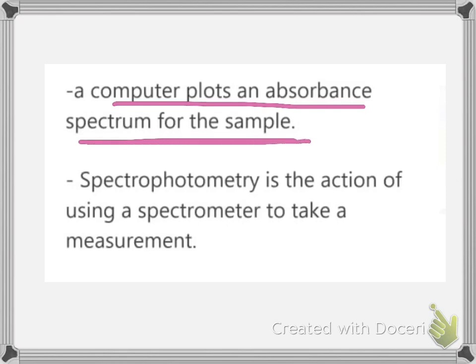Now, what is spectrophotometry? It is the action of measuring light absorbed by the sample using a spectrophotometer. That is, spectrophotometry is the action of taking a measurement using a spectrophotometer.